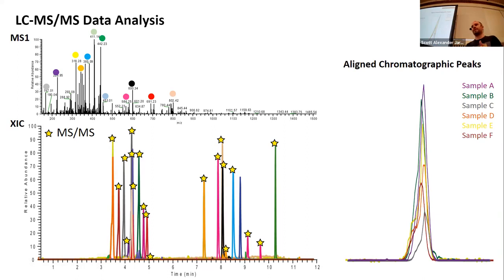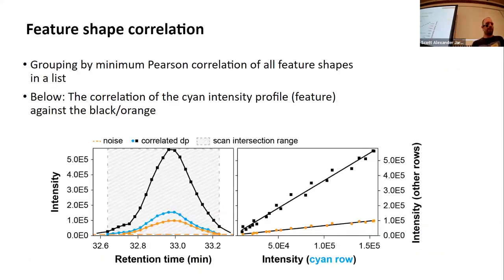This makes it much more accurate when you want to compare relative quantities between samples, because with only the MS2 level, you could theoretically do that too. And as Scott pointed out, if you have a very simple question, that might be the tool of choice. But obviously using sophisticated tools such as MZmine or XCMS or other feature finding tools, you get better semi-quant information.